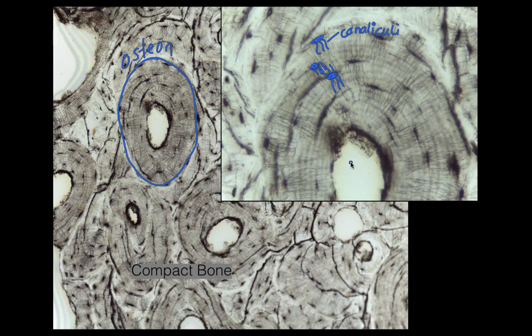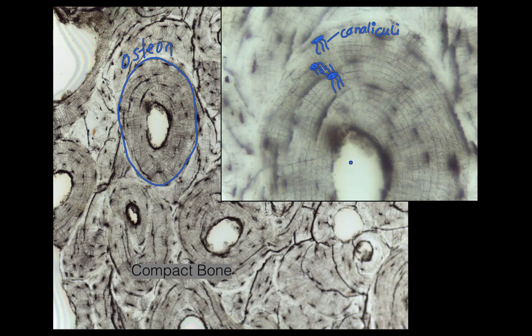If I change the focus on the microscope, we'll see the next structure of the osteon: the lamellae. You can see these almost look like tree rings. In between those layers — those are the lamellae, which just means sheet. So those are the sheets or rings of bone forming the osteon.